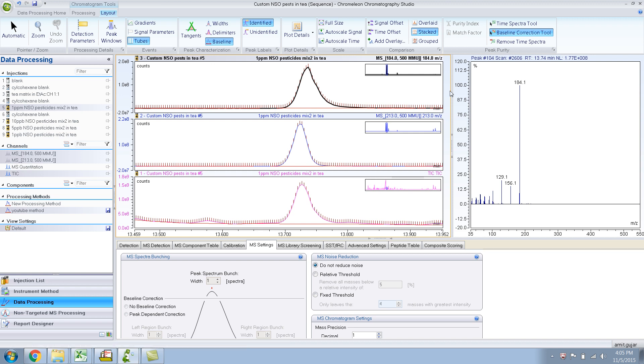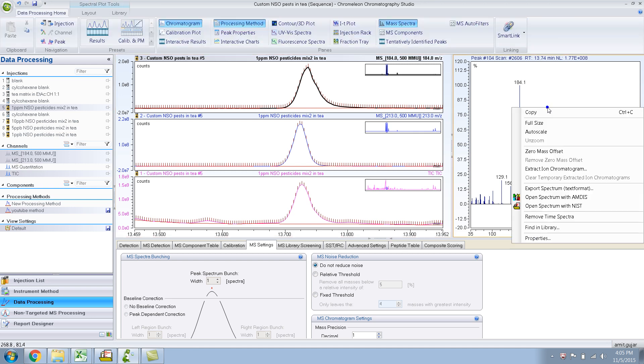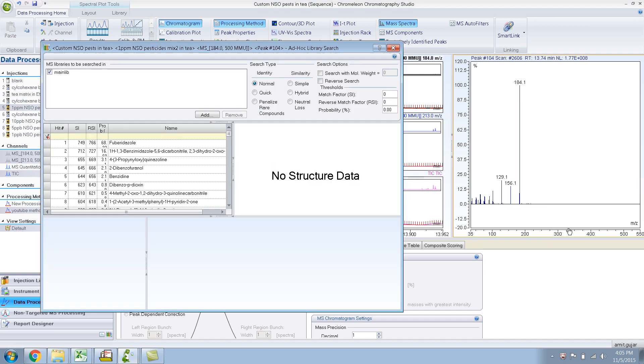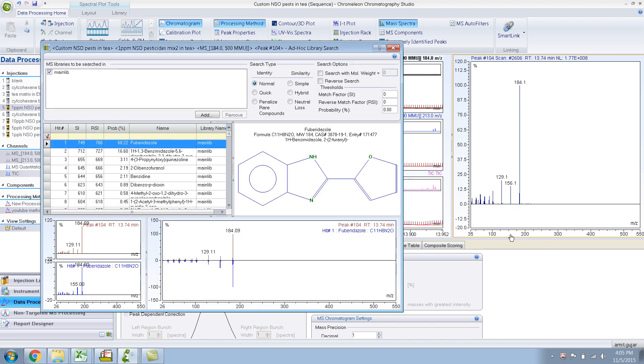And that looks like it has subtracted 213 almost completely, right? And now let me do a library search and find a library. Okay, there you go. Fuberidazole. So that seems plausible. It has all the major peaks which are due to Fuberidazole.